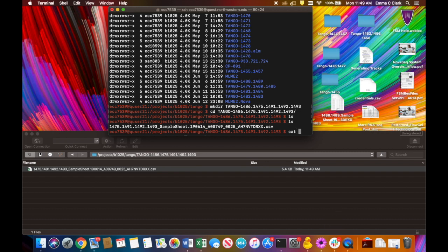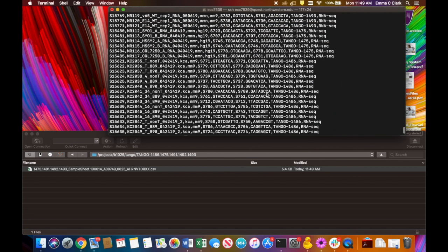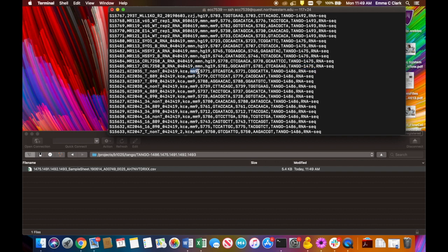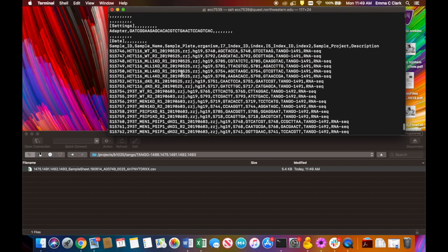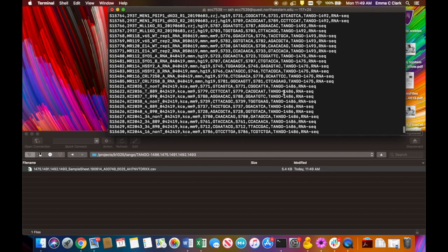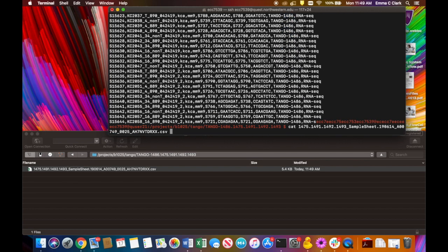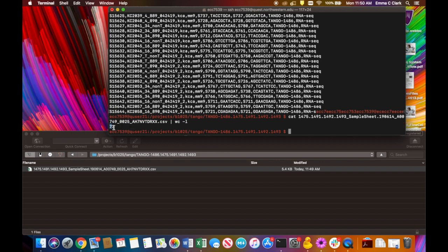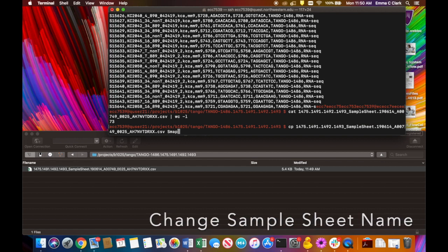And so first I want to actually look at it because I like to see the whole file in general, just make sure, yeah, we're doing RNA-seq. We look at different genomes, so MM9, HG19. And then usually there's some files that only have one genome, and then you're able to just simply do the sample name and then call it samplesheet.csv. I typically also look at how many lines are created, so I use the command wc -l.